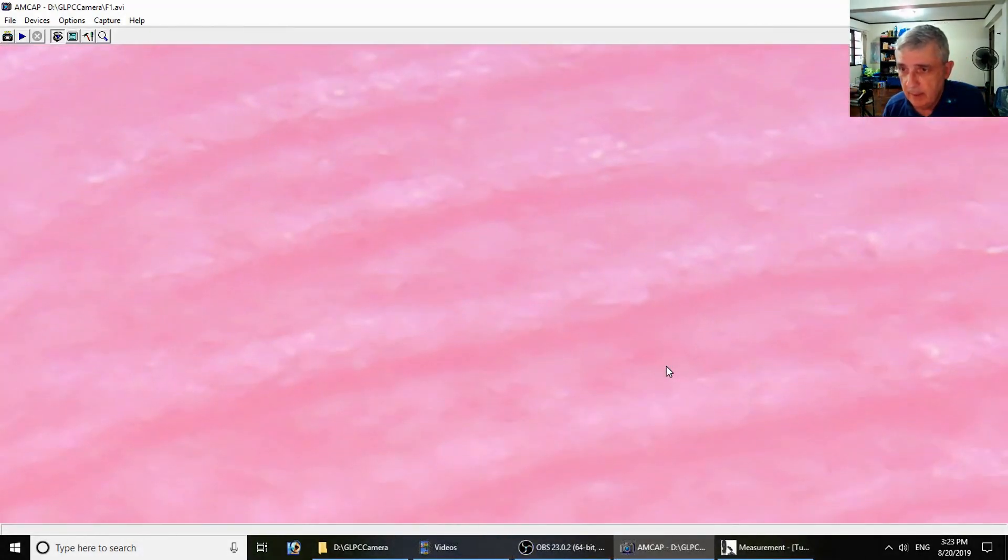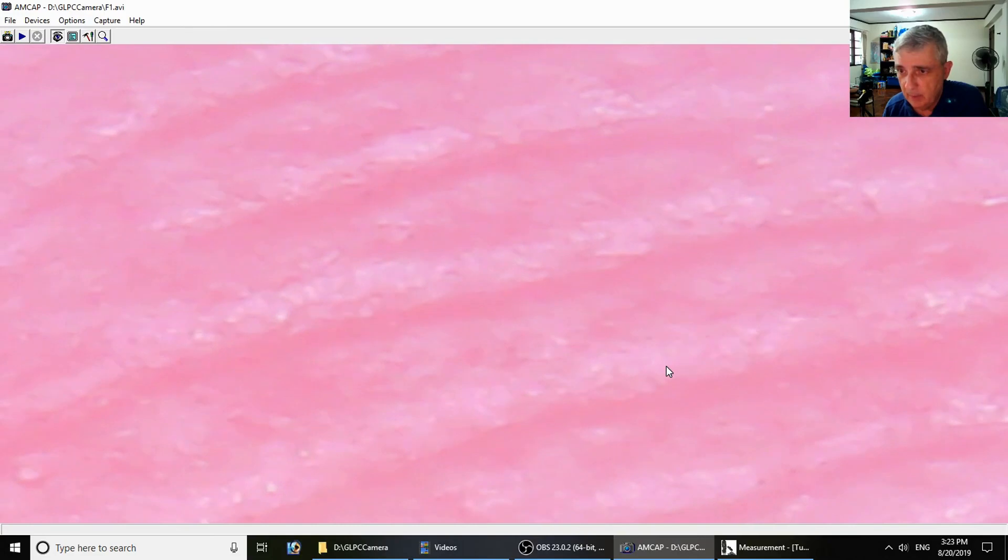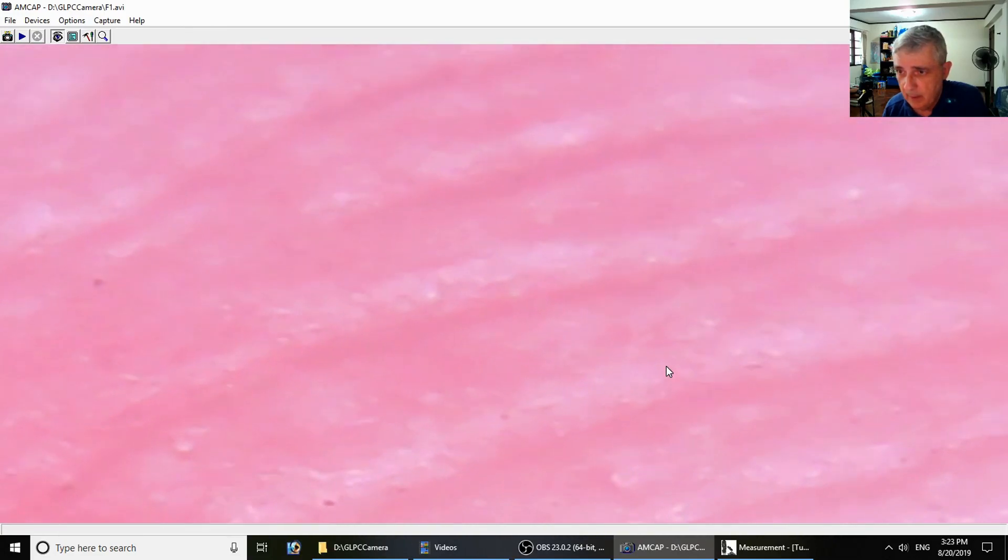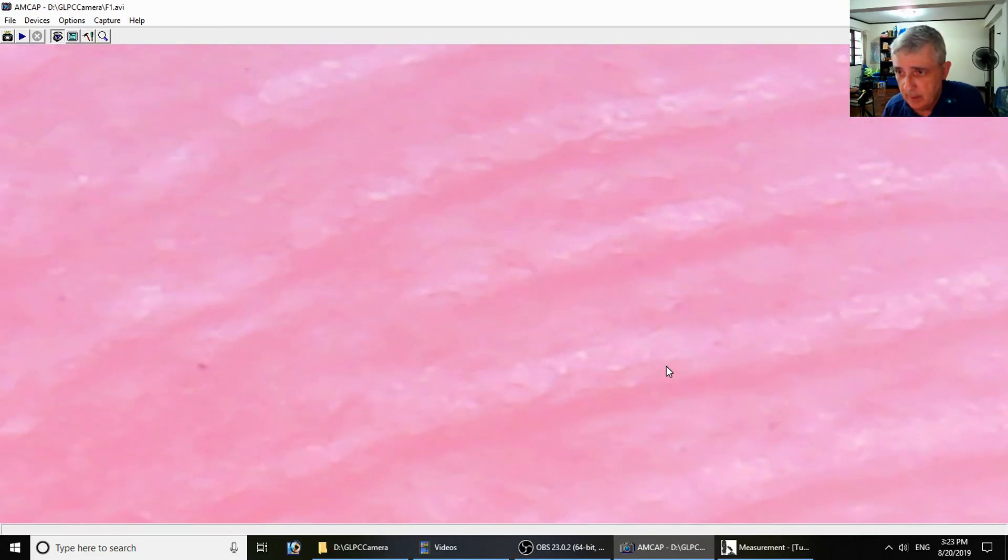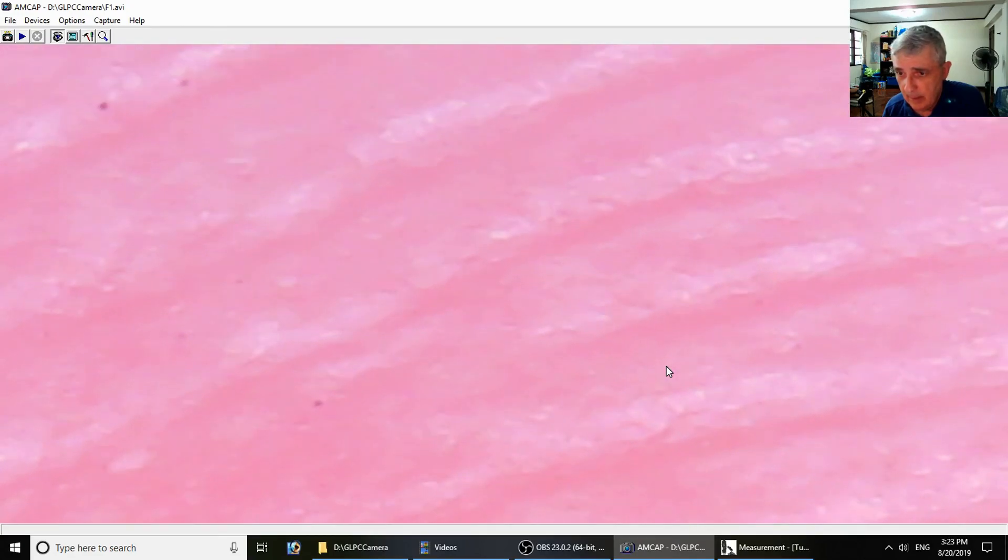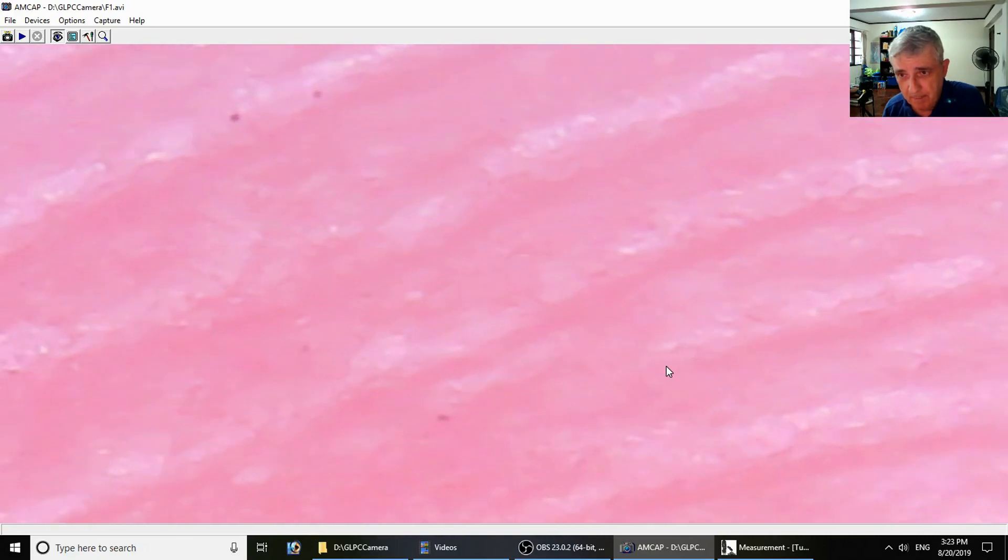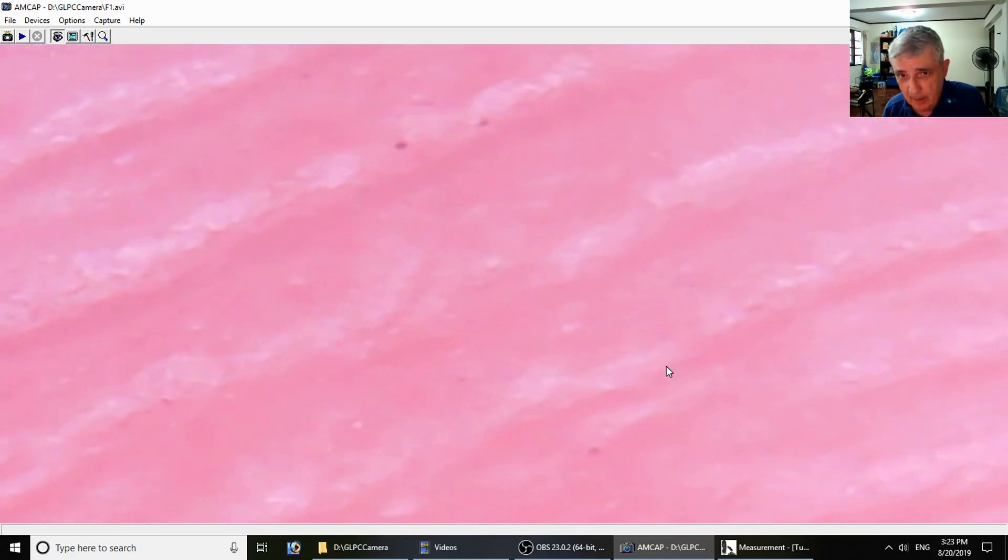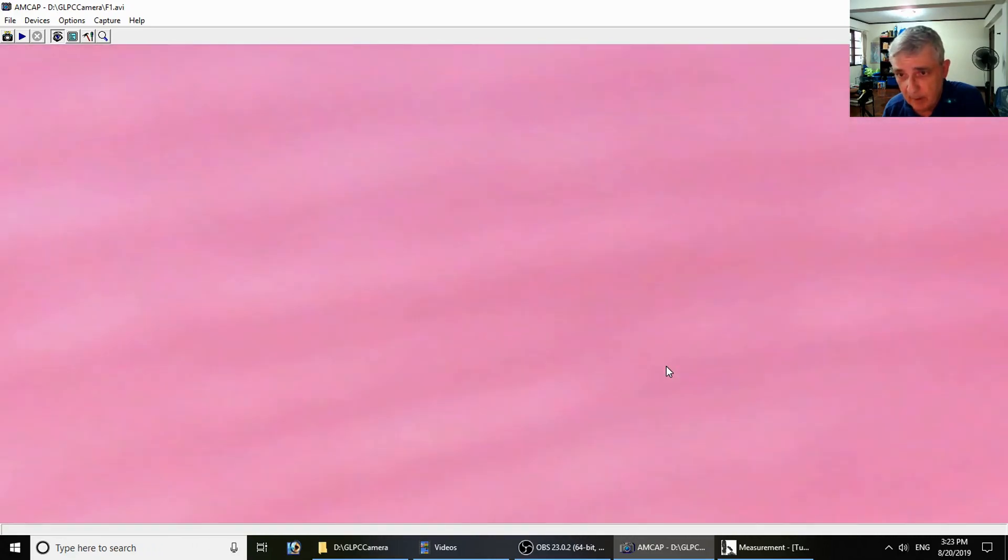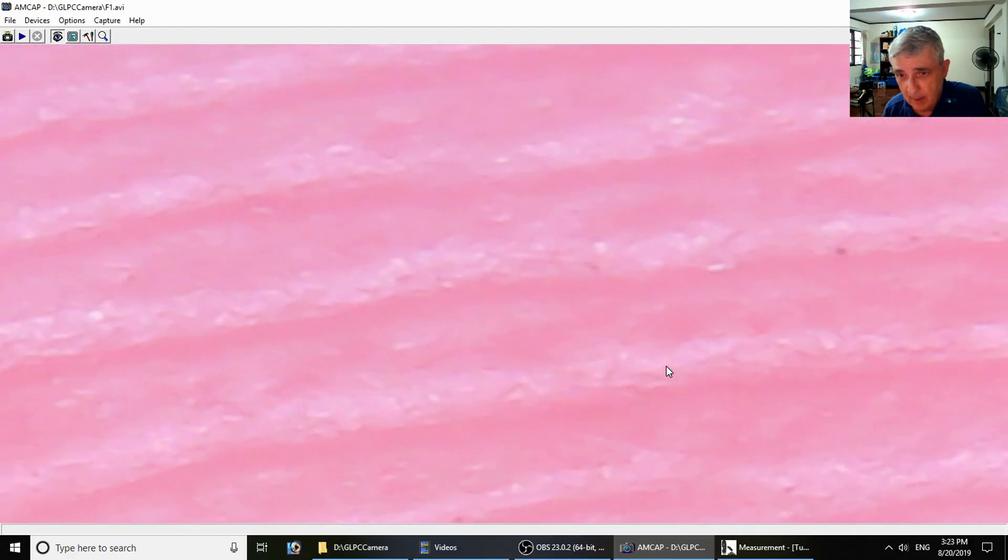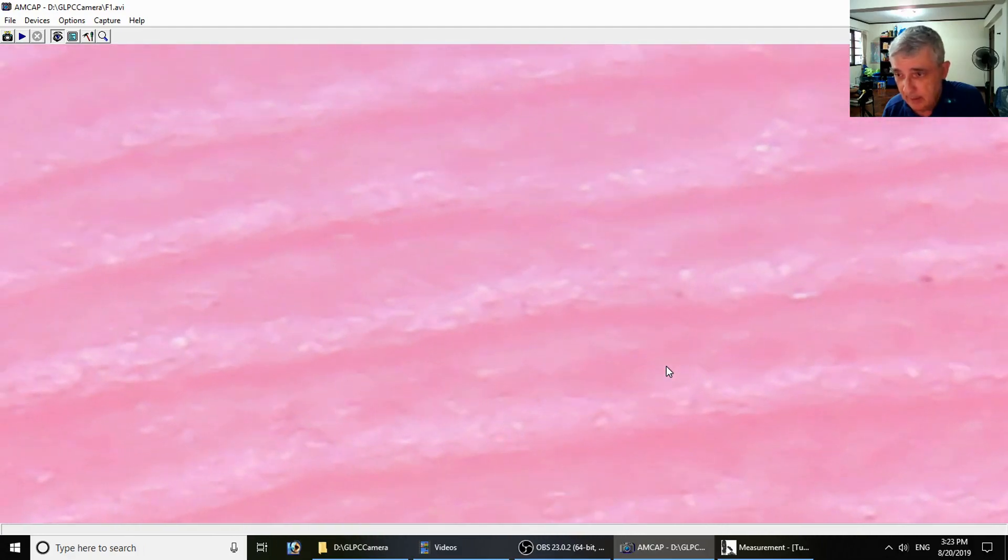This is part of my little fingerprint. If I can get it in focus... Yes, this is actually - you can see some dirt on my finger. These are the lines in my finger. Pretty strange looking.